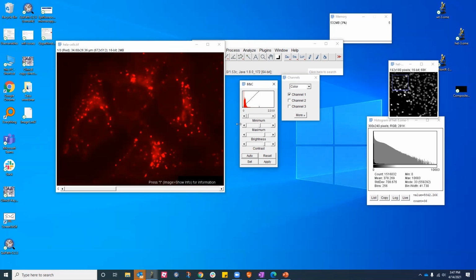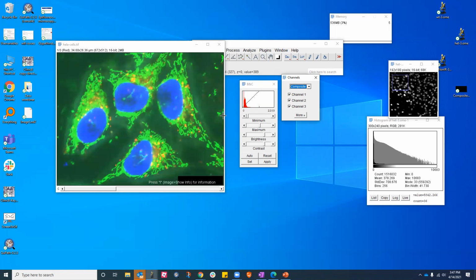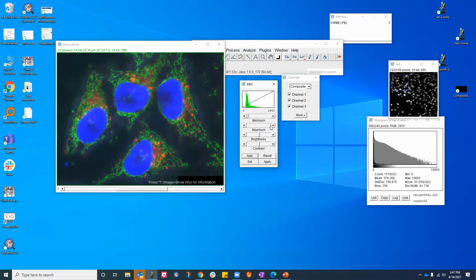You just need to be aware of what you are doing. Okay. So again, just to rehash this, you can go to composite. If my reds are too dark, I can change that. If my greens are really saturated, I mean, they're not saturated in real, but in terms of display sense, they're saturated. And my blues were super bright, so I'm making them reasonably bright.